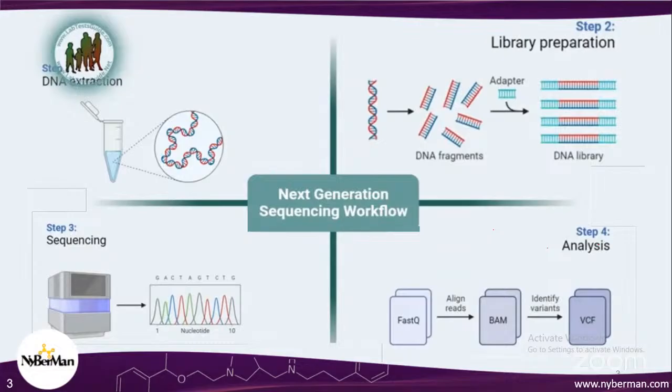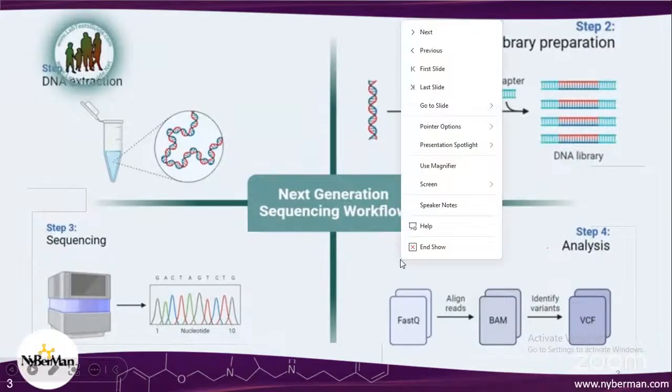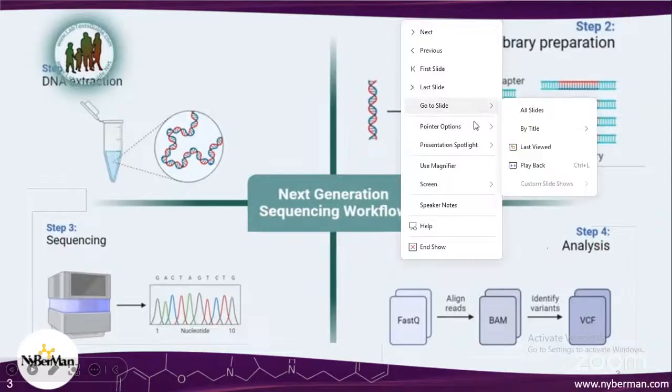Whenever I refer to raw data ahead in the course, I will be talking about FASTQ files. Or if we do microarray analysis, then we will be referring to CEL files, because when we perform microarray analysis, the raw files are in CEL file format, not FASTQ. FASTQ files are specific to RNA sequences or DNA sequences that are coming from Illumina.